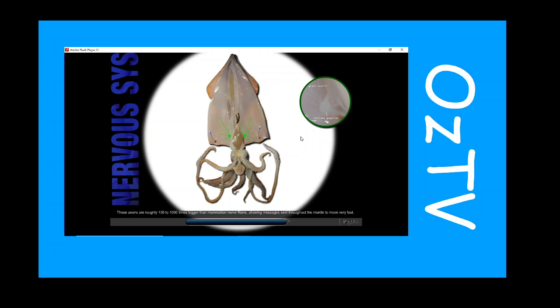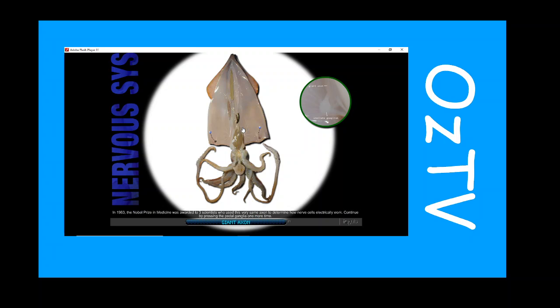These axons are roughly 100 to 1000 times bigger than mammalian nerve fibers, allowing messages sent throughout the mantle to move very fast. Due to its size, one of these axons called the giant axon has led to much of our knowledge about nerve function. Find and press on one of the giant axons. In 1963, the Nobel Prize in Medicine was awarded to three scientists who used this very same axon to determine how nerve cells electrically work.